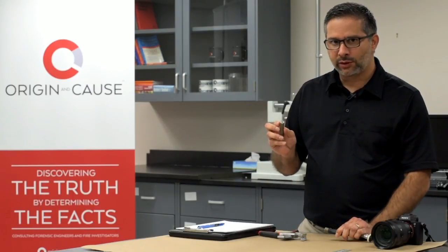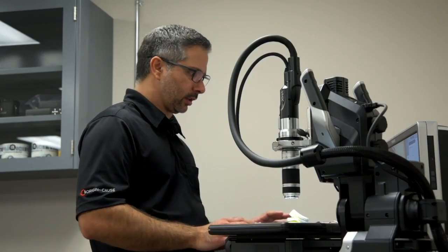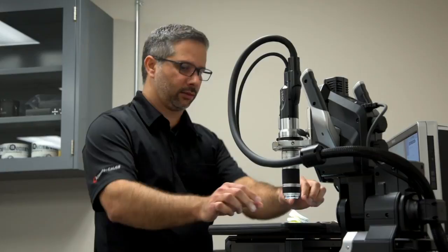So now that I have exposed the inner hose, let's go to the microscope and see how it looks. Let me show you first how a perfectly healthy inner tube looks. You can see here is the white inner tube. It has some yellowish discoloration.